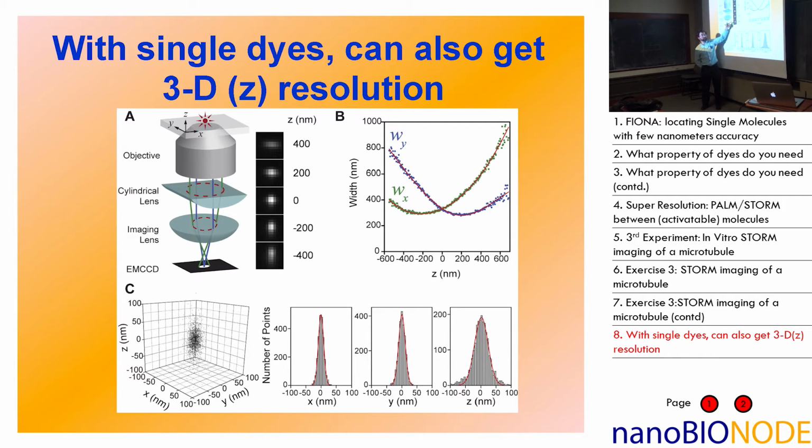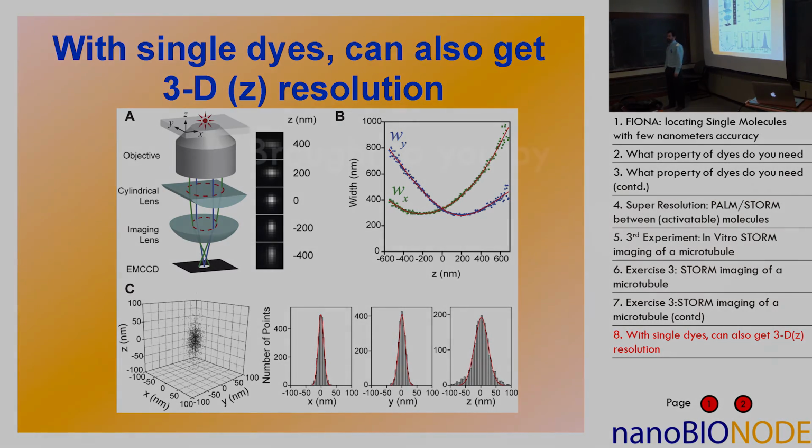So to the extent that this is not really strong, the background due to the EMCCD is actually significant. The precision with which you can determine this is slightly less here than here. But that's a minor point. Okay, thanks a lot, guys.